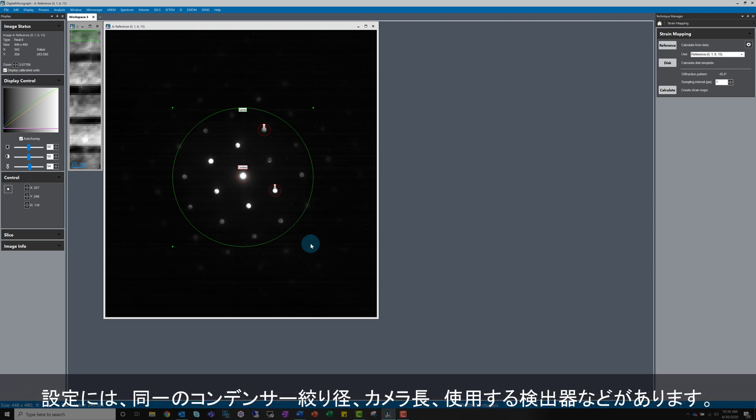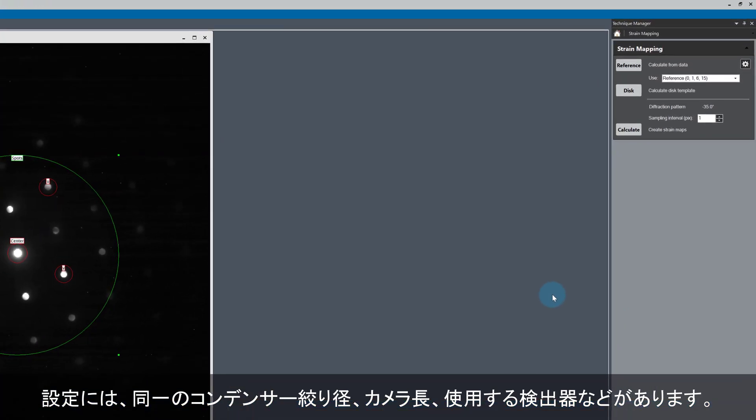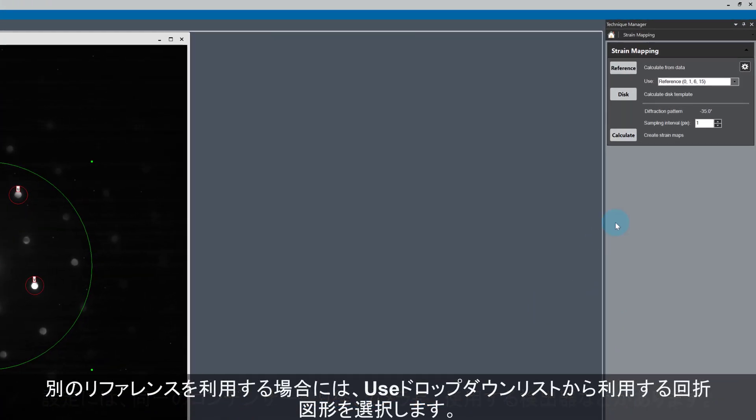In particular, the same probe forming aperture, the same camera length, the same detector. Otherwise using the data as a reference doesn't really make sense. If you want to use this feature, you can make your selection from the drop down menu right next to use as I'm showing here.